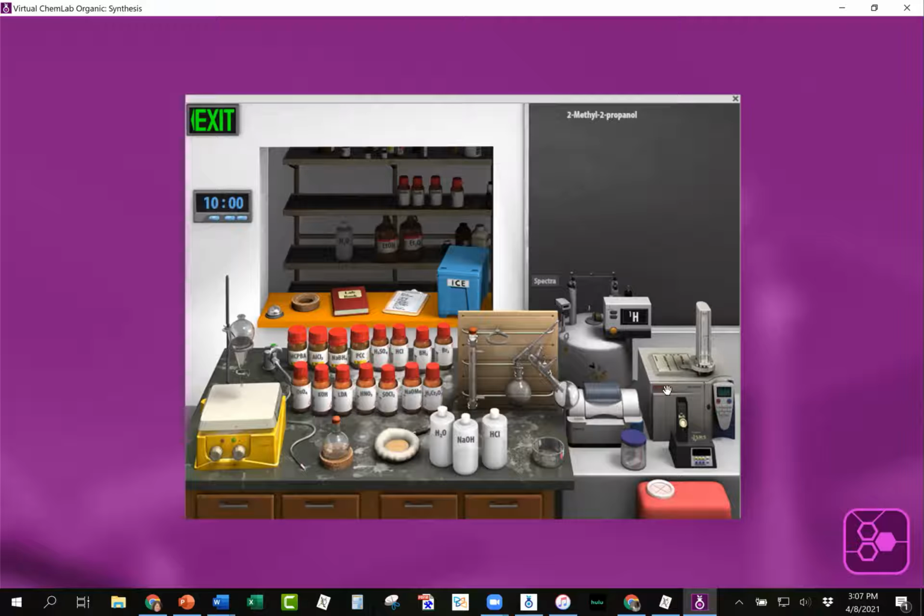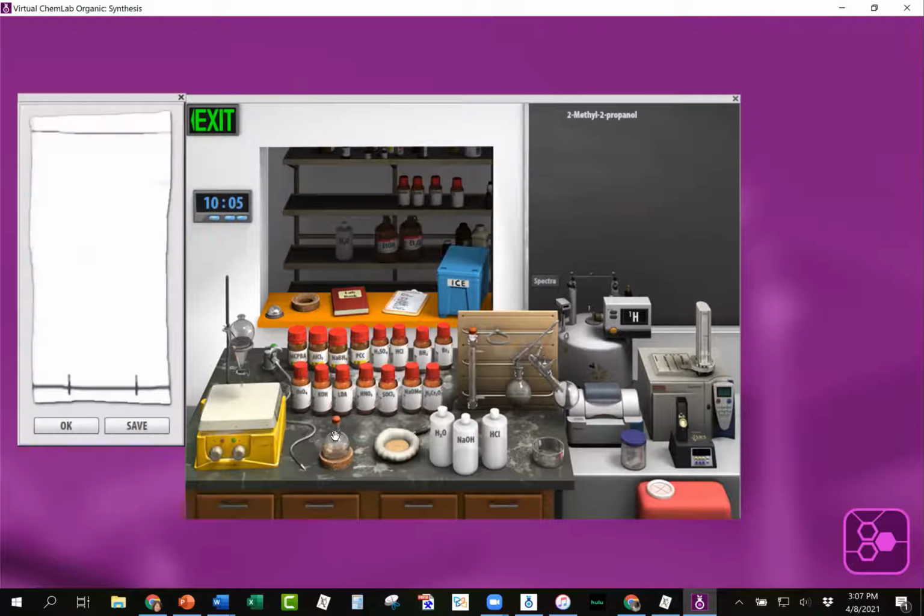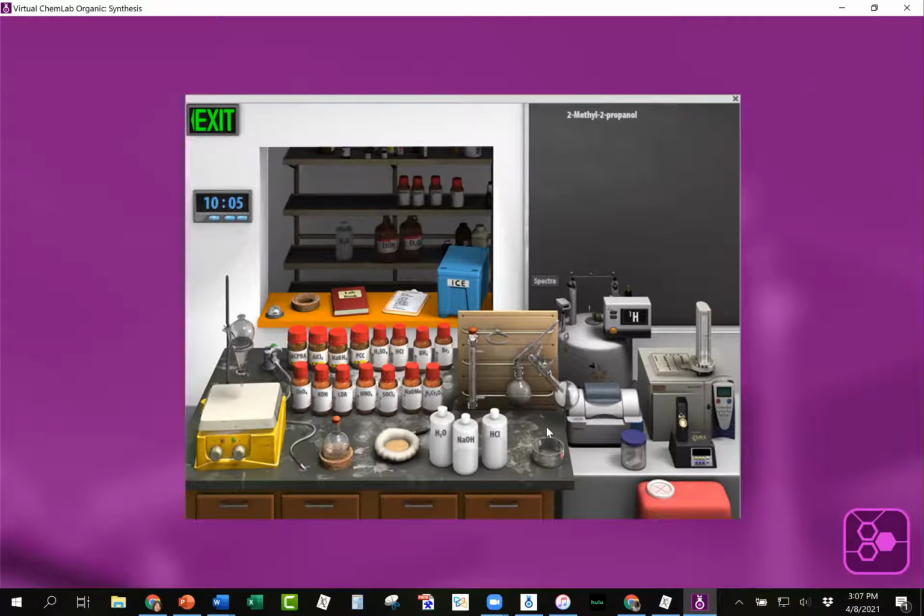And then we have all these different tools for doing analysis. They can do TLC plates. You can set that up at the beginning. I forgot to do it at the beginning of the reaction, but I do direct students to do the TLC plates at the beginning. They can monitor the progress of the reaction. So we'll have them take a TLC plate of just the starting materials, halfway through after 10 minutes or so, and then later at the end, so they can see how the polarities have changed. Some of those reactions can be monitored by TLC.